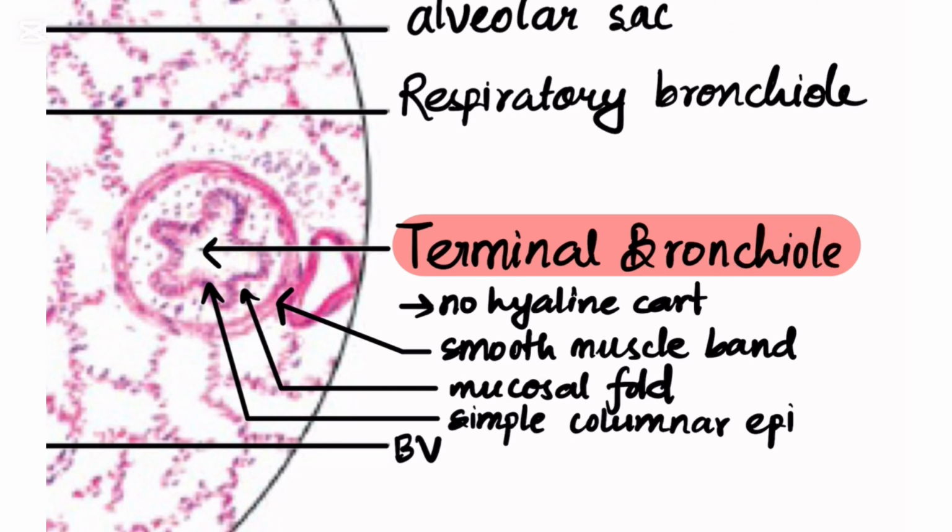Second, so let's look at the layers. You have mucosa, innermost is epithelial mucosa, and the epithelial mucosa now is not a respiratory epithelium. Now it is simply simple columnar epithelium. There are no cilia found, and it is not pseudostratified. It is simple columnar epithelium.